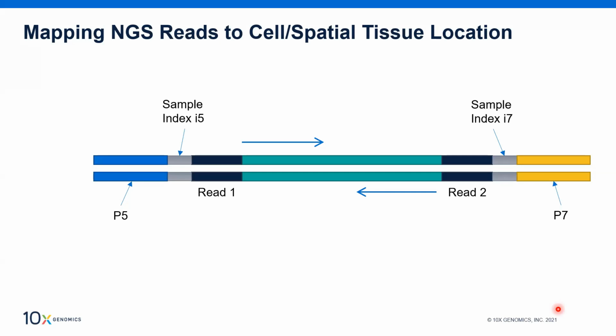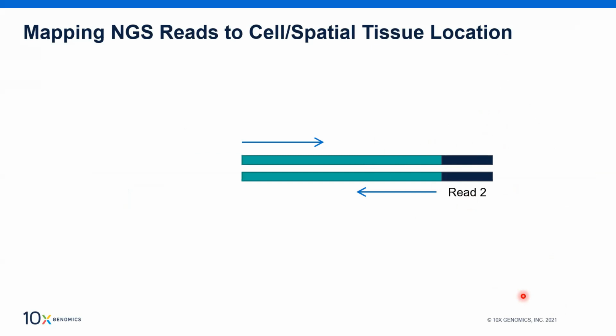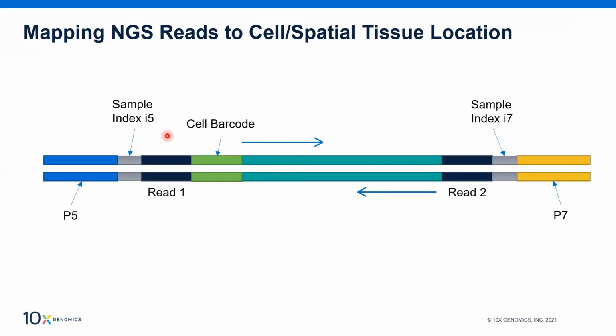Right now we are able to segregate data sample-wise, meaning which read is coming from which sample. If you want to trace reads to the cell, I have to add a cell barcode to that element. That is the need. Then I add the other adapters upstream and downstream of those sequences. Now I will know which sample the read is coming from and which cell it is coming from. So the sample is demultiplexed and the cell data is also demultiplexed. This is the purpose of single cell technology.